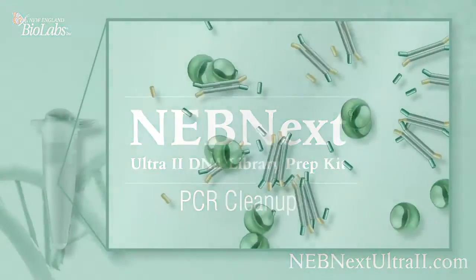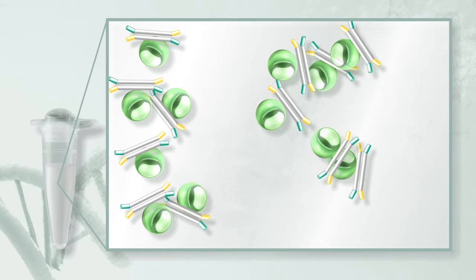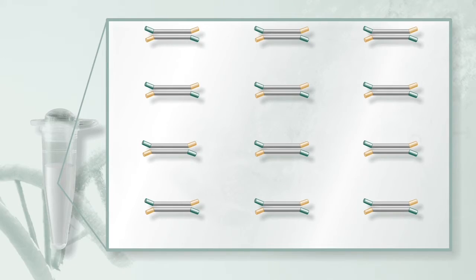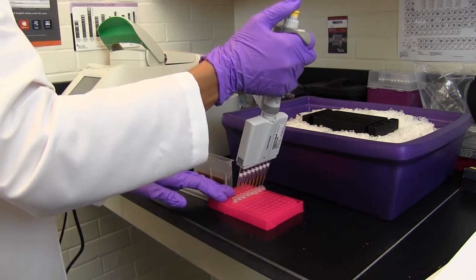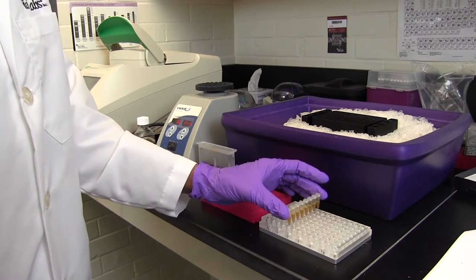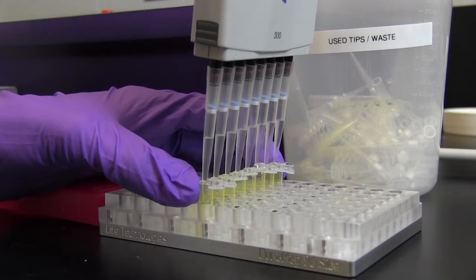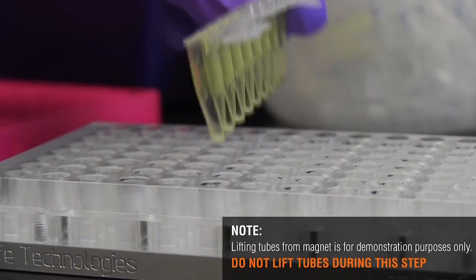This step also uses magnetic beads, but this time there is a single step after which the desired DNA — the library — is bound to the beads. Don't discard the beads. Add 45 microliters of vortexed magnetic beads to the reaction and mix well by pipetting up and down at least 10 times. Incubate at room temperature for five minutes, followed by exposure to a magnetic field. After five minutes, remove and discard the supernatant without disturbing the bead pellet.